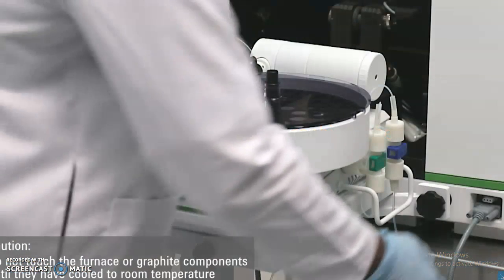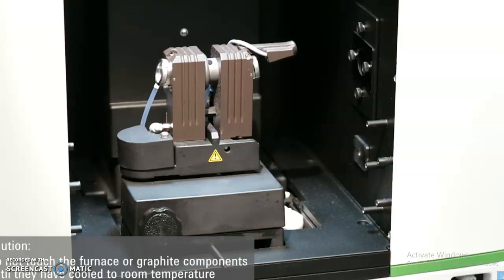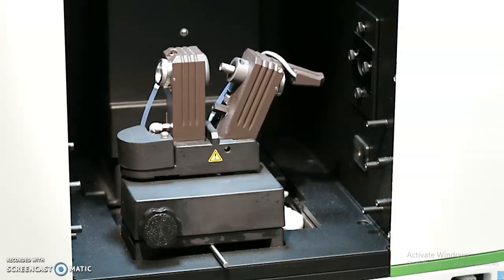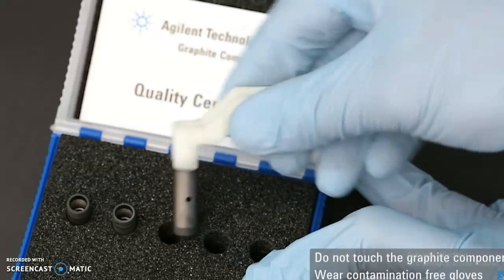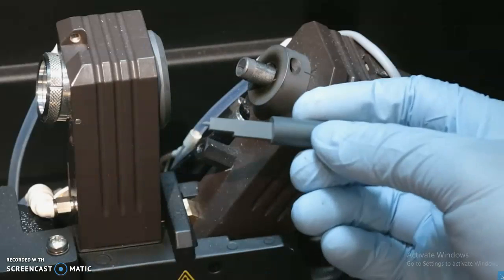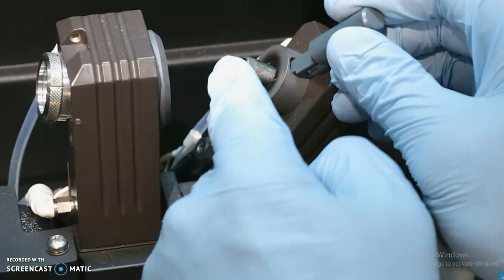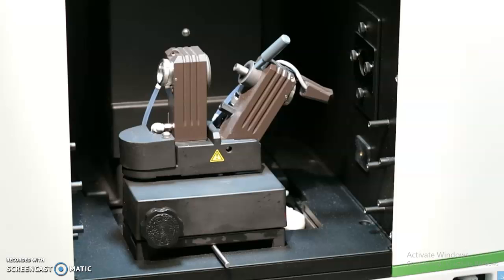Release the autosampler by undoing the left and the right knob and swing the autosampler away. To remove the graphite tube, click the open close button in the furnace control window of the software. Remove the graphite tube. Insert the new graphite tube into the right hand side of the furnace contacts. With the flat side of the alignment tool facing left, insert the tool into the sample injection port and align the graphite tube. Click the open close button in the furnace control window to close the furnace.